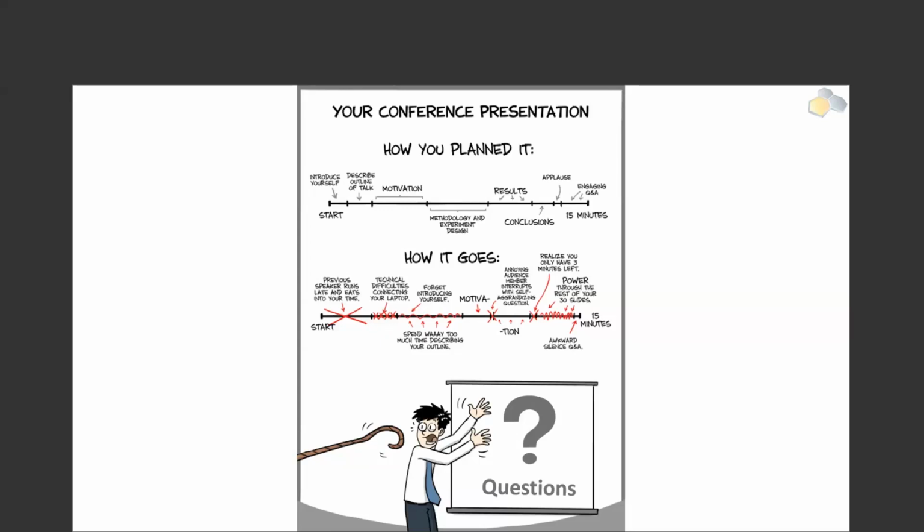And on the other point, whether the SNV analysis can be done by Hexagon, that's absolutely true. Hexagon will return the frequencies of the point mutations, or essentially small insertions and deletions, per position, and you can focus on SNVs through this analysis with Hexagon, which you can perform after you remove, for example, reads that have been attributed to DVGs.